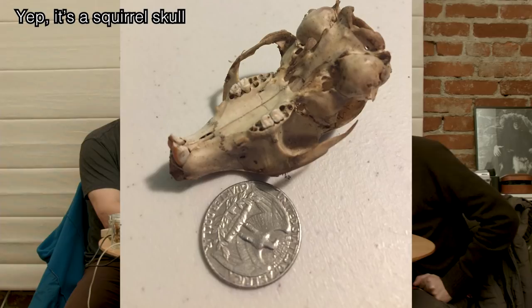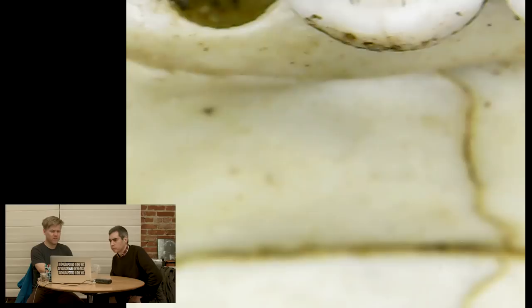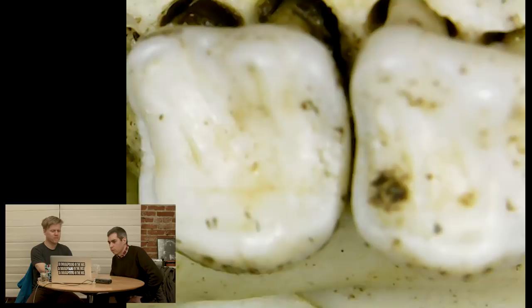Let's look at its teeth. Those are the teeth. Wow. That's coming at an angle. Oh, those are the front teeth — the two front teeth. So it's like... these are its upper... those are like molars, like humans have. They look like real teeth, but they're just so small. These are tiny. It looks like a spider's nest in there or something. So these are the teeth, the upper molars. As you can see, there's a few — look into those empty sockets. There's a few missing here.